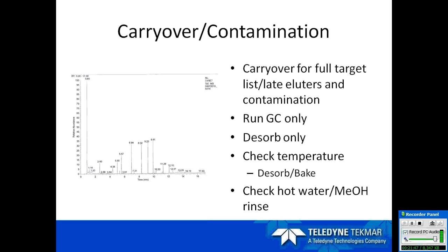One of the nice things about the newer systems on the market is that most of the tubing is the latest and greatest as far as inert types of tubing, whether it's in the sample valve or in the transfer line. The sample pathway or the sample transfer lines are now PEEK tubing. And we also have mass flow controllers. So you can set your purge to still be 40 mils a minute, but now you can ramp up your flows to 200 or sometimes even 300 mils a minute during the bake stage and really push anything that's left over on that adsorbent trap off and out the vent. So that's going to take your times down. Over the years, as we've improved the tubing and flows, we are now able to get those bake times from upwards of 10 to 12 minutes down to maybe 2 to 3 minutes, depending on what you set your bake flow at.